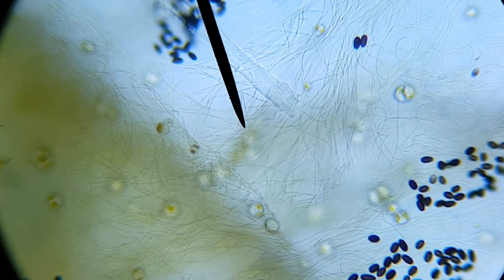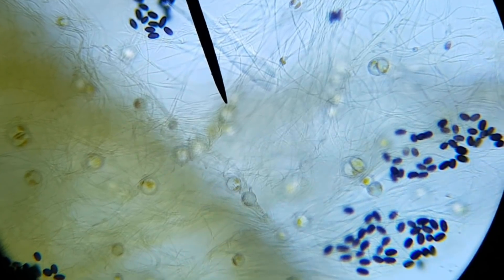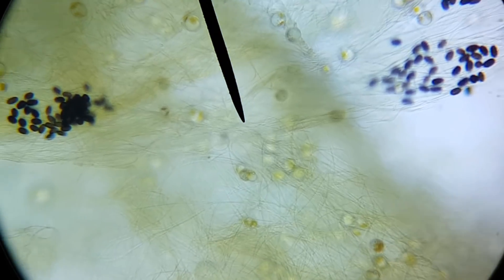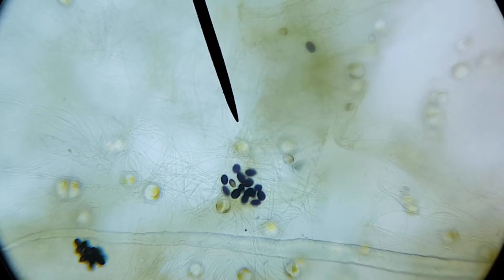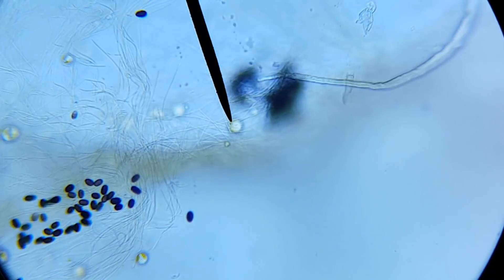I have no clue what these black things are. I've never seen them before. But then again, I've not seen that much through the microscope yet. Perhaps there's some sort of unicellular organism that turned themselves into cysts. If that's even a thing. I know bacteria can do that, but these aren't bacteria. They are all clumped together, so there's definitely something going on.